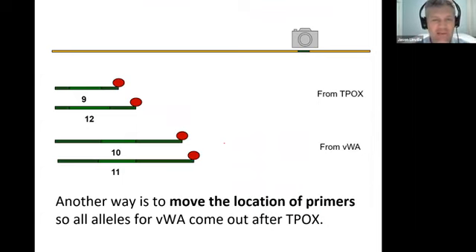Right now, the maximum number of colors that they can get for a camera to differentiate them and not get confused is, I think, 7, okay? Because the old timers use 5, and then the new kits use 6, and I think some of the newer kits are trying to use 7, but usually 5 or 6 dyes is standard as far as how many different dyes you use.